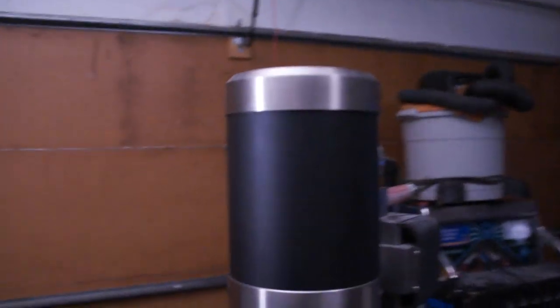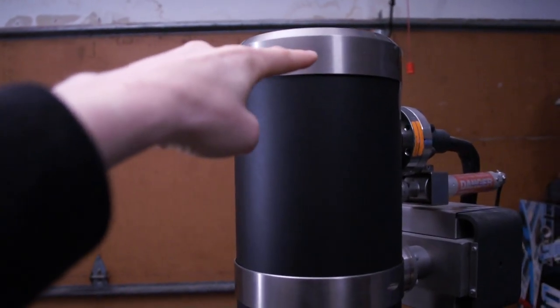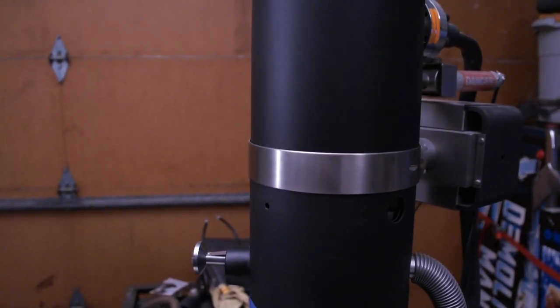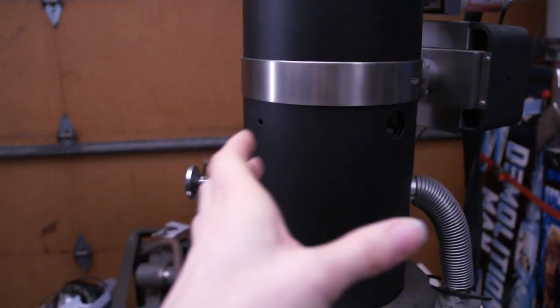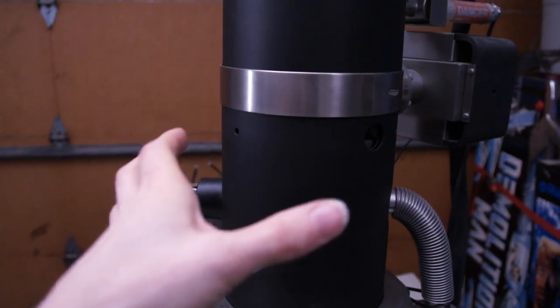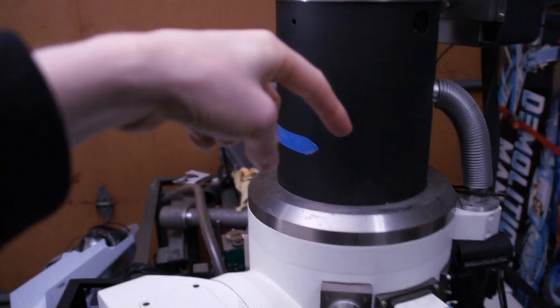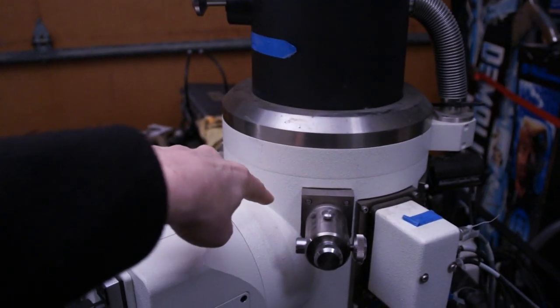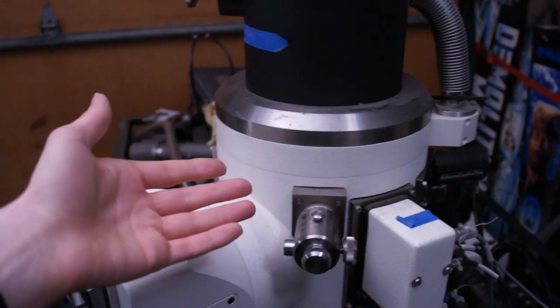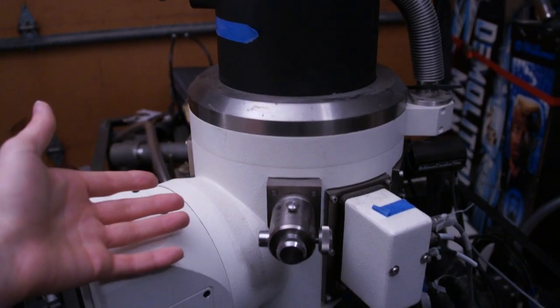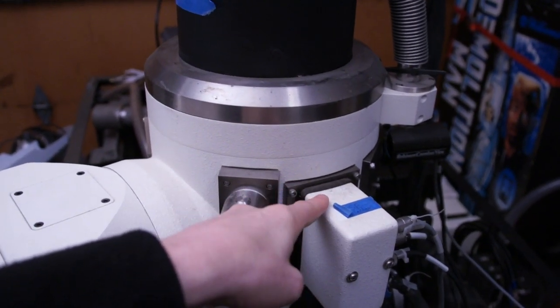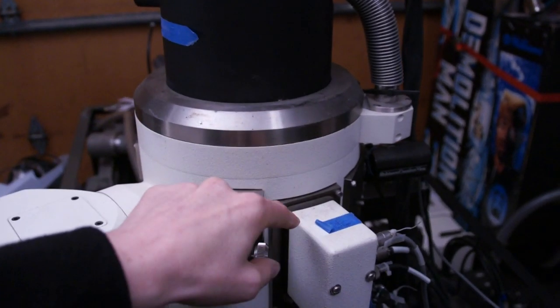The theory of operation on this is the electrons are streaming down from the top through a little tube here. There's some electrostatic lenses that help focus it down to a point. There's some magnetic deflection and astigmatism adjustments. So the beam is focused and swept, and then your sample is down in the center of this, and the beam is sweeping back and forth, hitting the top of your sample. Some electrons are being absorbed, some are bouncing off. The ones that bounce off reach a detector.